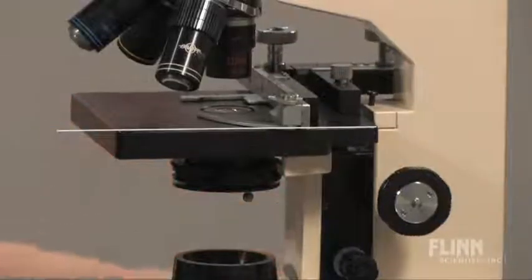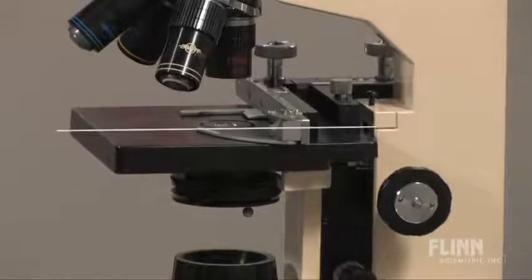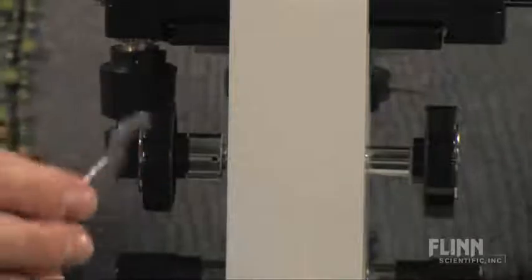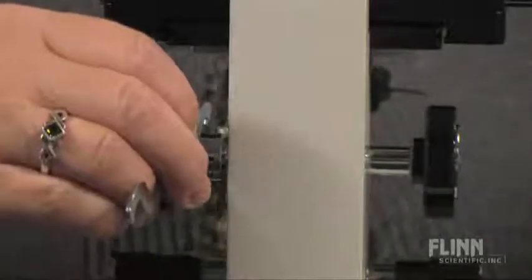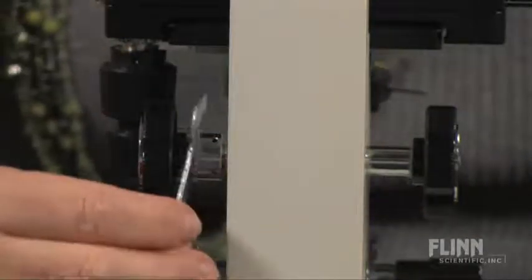The third most common call that I get about microscopes — and one that you need to watch for as your microscopes get older — is a dropping stage. What happens is the tension loosens on the focus and the stage will actually physically drop because there's not enough tension. Different manufacturers have a different method to tighten that. In the case of the microscopes that Flynn sells, it's a tool like this, and if you look on the coarse knob, there are little holes and you insert the tool into the hole and tighten the stage to keep it from dropping.